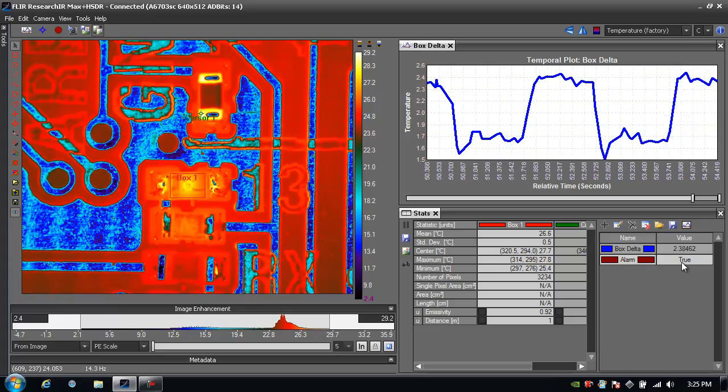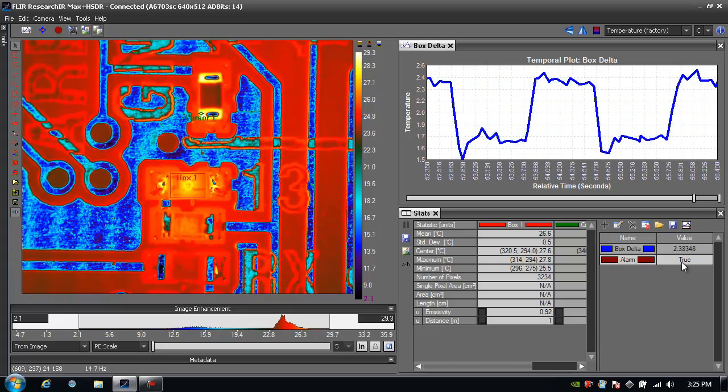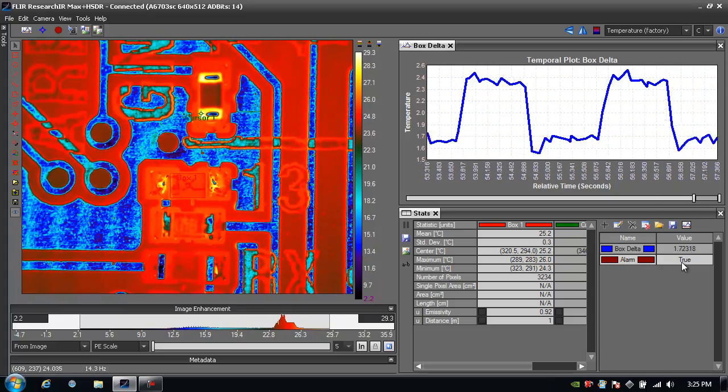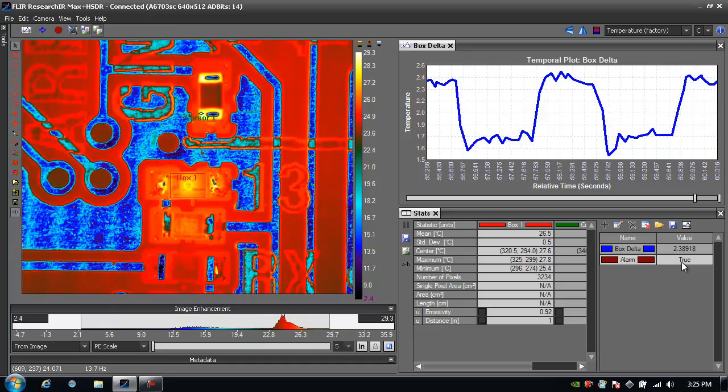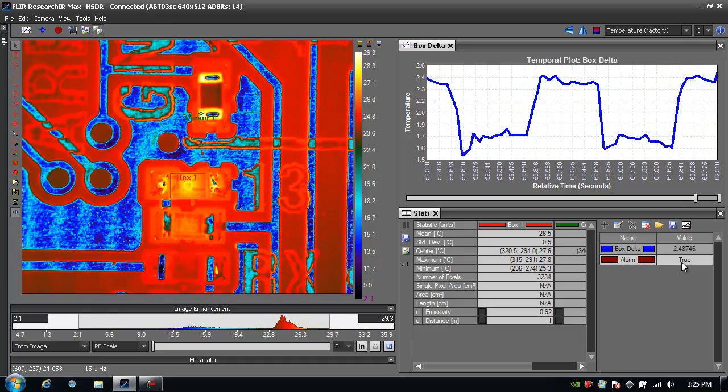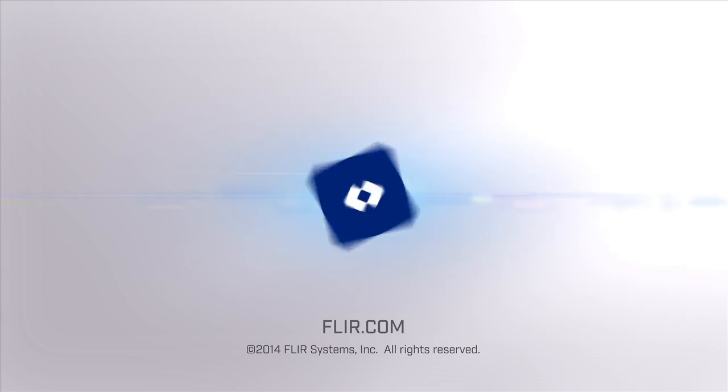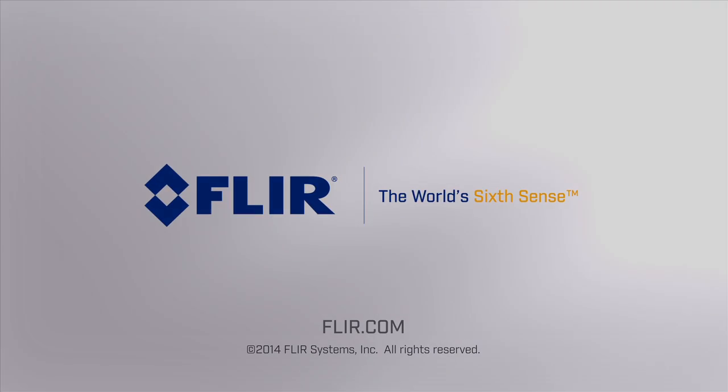But that's measurement functions, very easy to use. For more information on Research IR Max, please reference the other tutorials available online. Thank you for tuning in.